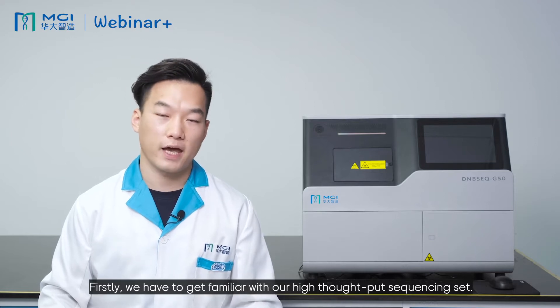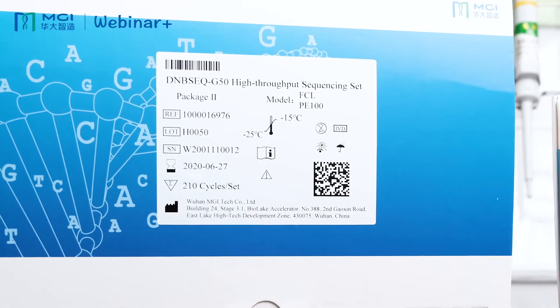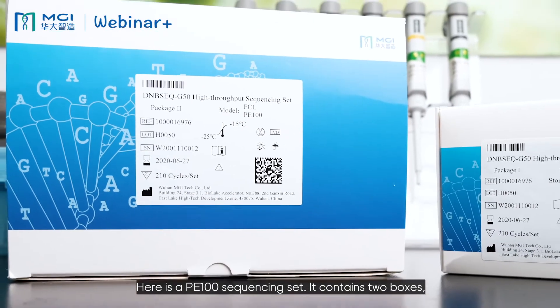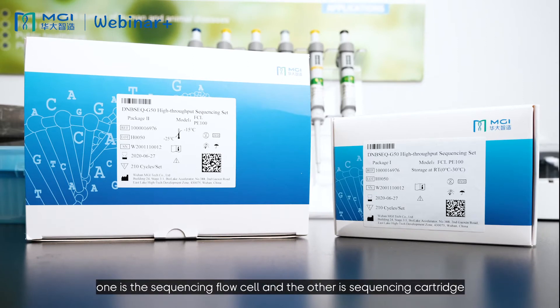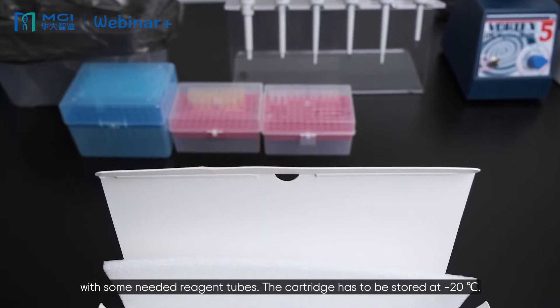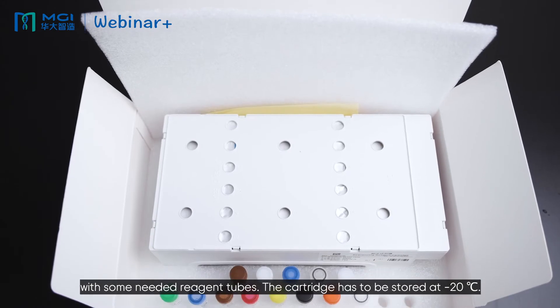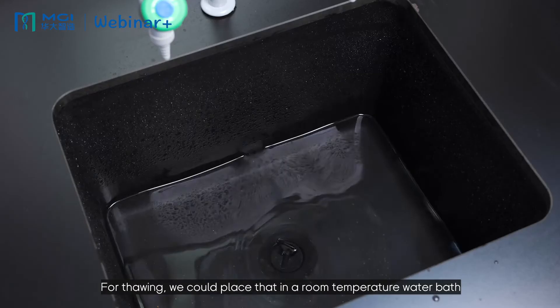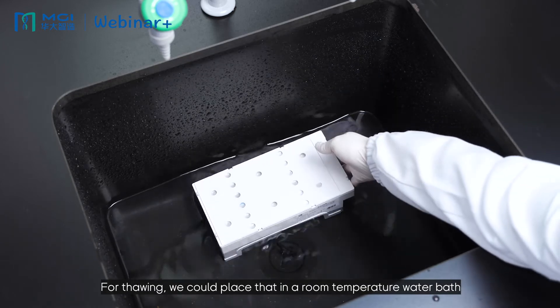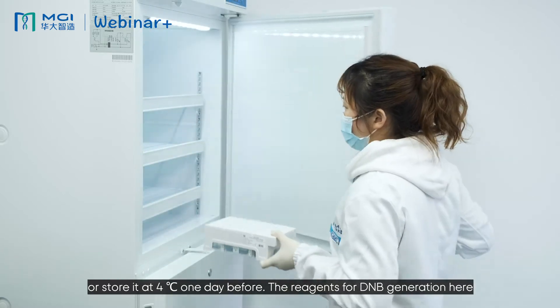First, we have to get familiar with our high-throughput sequencing set. Here is a PE100 sequencing set. It contains two boxes — one is the sequencing flow cell, and the other is the sequencing cartridge with some needed reagent tubes. The cartridge has to be stored at minus 20 degrees C. For thawing, we could place it in a room temperature water bath or store it at 4 degrees C one day before.